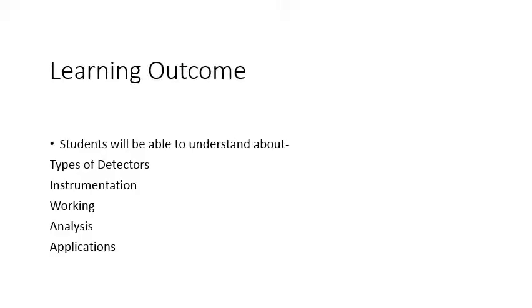The learning outcome: you will be able to understand gas chromatography completely by covering the types of the detectors, the instrumentation part, its working, analysis, and the applications.